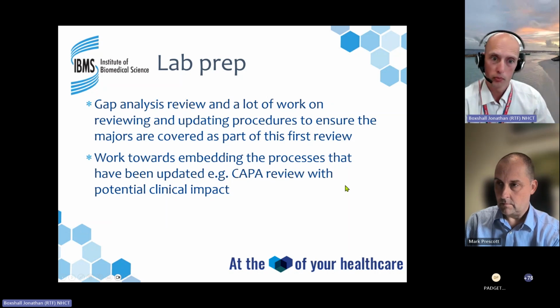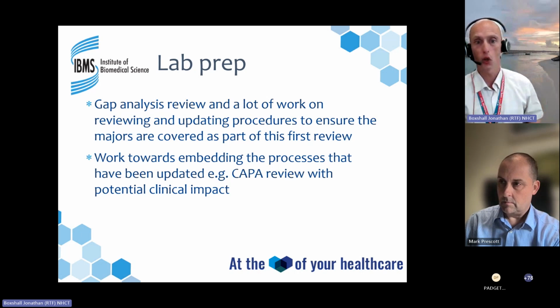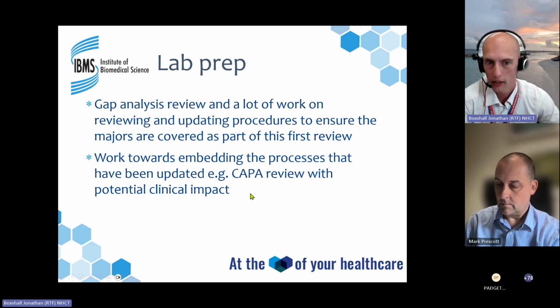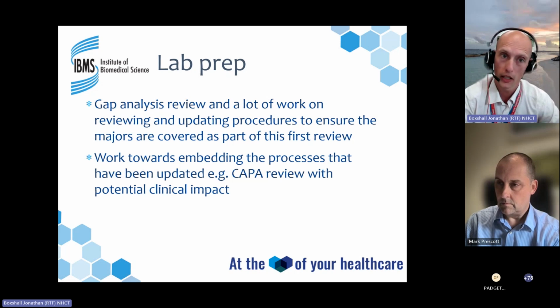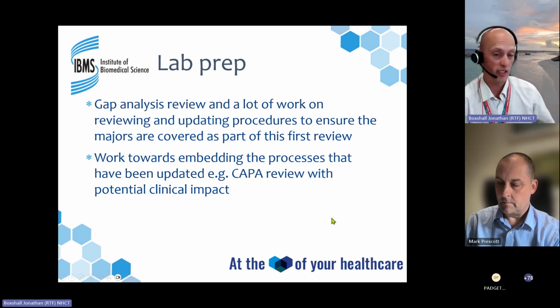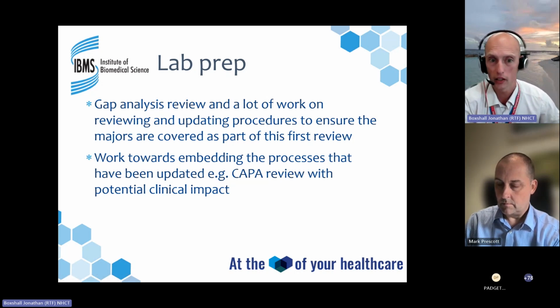Where they may have made a couple of comments in a speciality board or a quality meeting, this was actually fully documenting in a CAPA for an issue that they are aware and what their recommendations are, or them effectively saying there is no clinical impact, so they're happy that they don't need anything further.